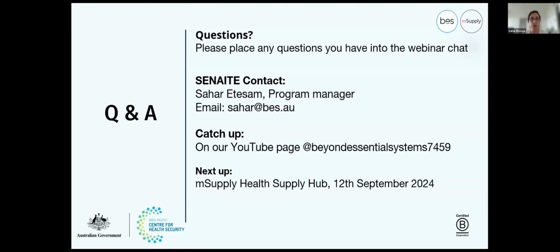At the moment, for the PNG microbiology department, we have 21 reports, and we added another 6 to it based on their requests. All of those specific requirements for the final statistical reports come from the labs, and we can customize them and they can use them.